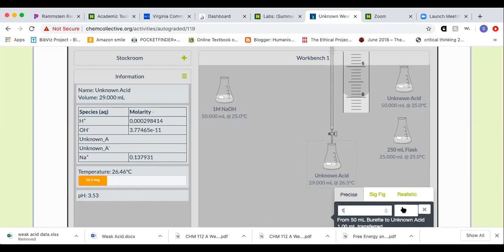And so you just keep going through this, and every time, you'll be collecting X and Y data for your Excel sheet. So with each new volume, and then see, then we got a jump. That would have been that big jump. So we're past the equivalence point, but I'm doing it in 1 milliliter aliquots, so that's probably not super accurate.